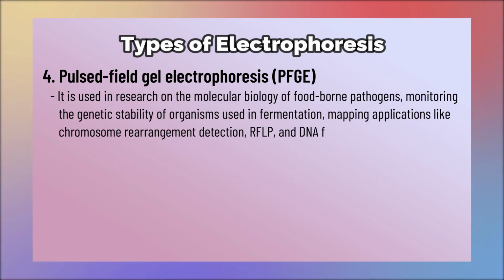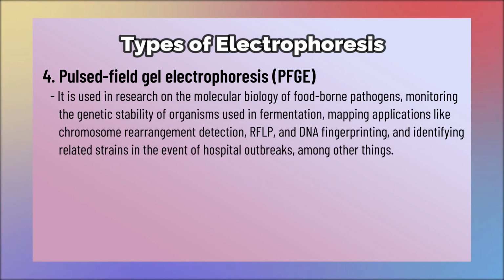It is used in research on the molecular biology of foodborne pathogens, monitoring the genetic stability of organisms used in fermentation, mapping applications like chromosome rearrangement detection, RFLP, and DNA fingerprinting, and identifying related strains in the event of hospital outbreaks, among other things.